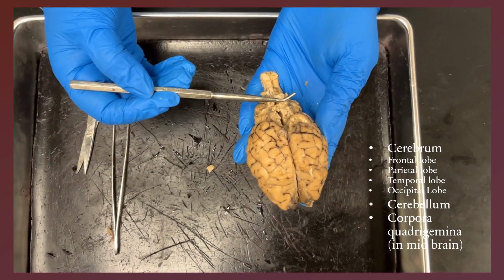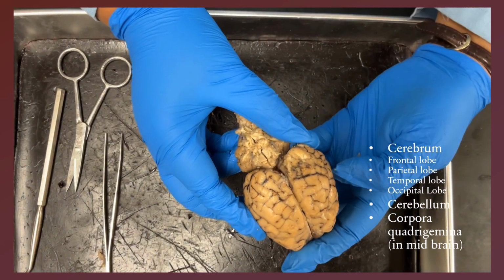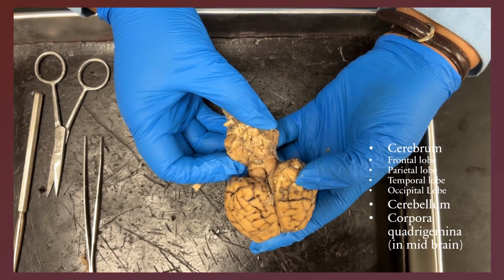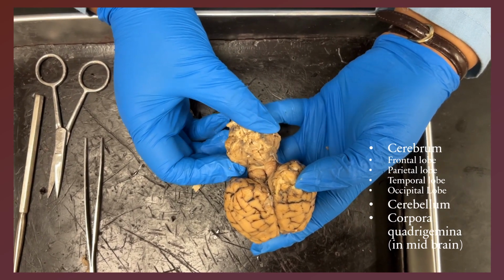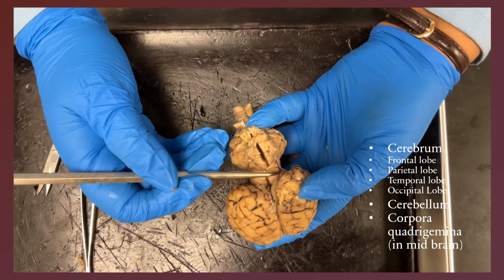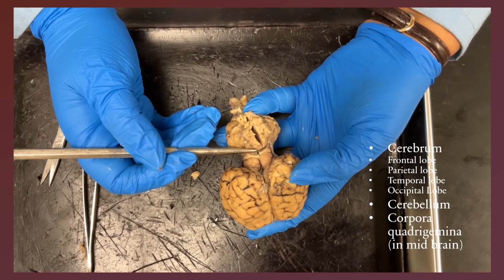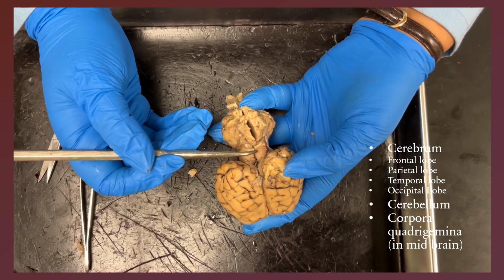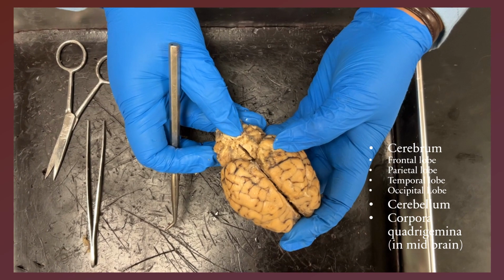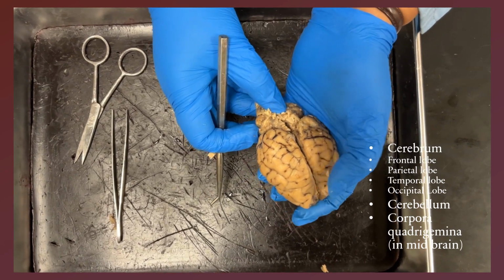So forebrain, hindbrain. Here, if we gently pull the hindbrain from the forebrain, we will be able to see the corpora quadrigemina. So this area is the corpora quadrigemina, which is part of the midbrain, where there are 2 distinct regions: superior colliculi and inferior colliculi. This remains hidden in between the forebrain and hindbrain when we are looking from the superior external view.